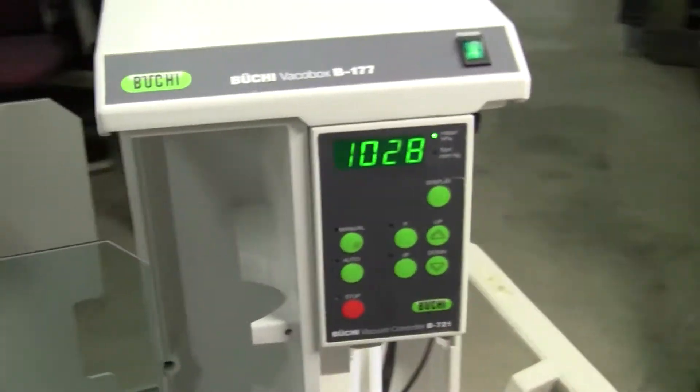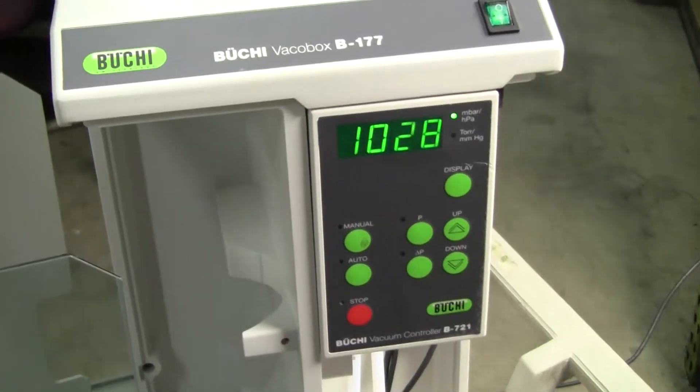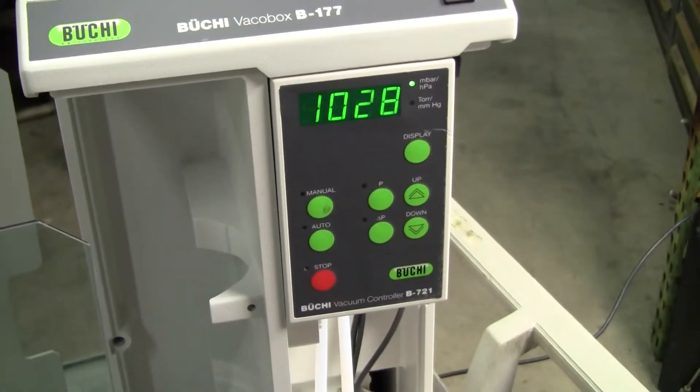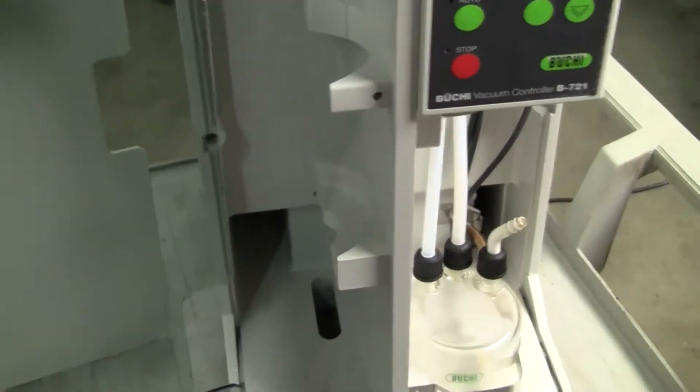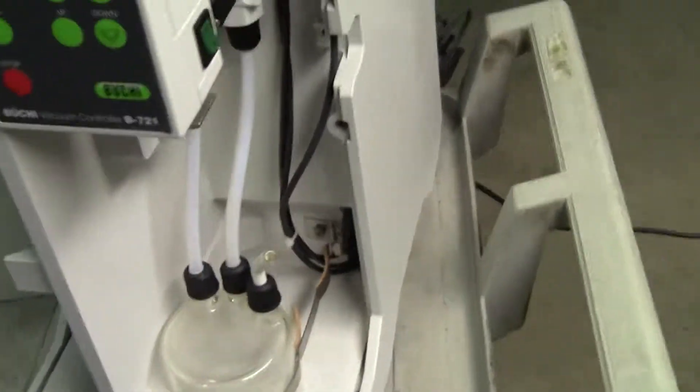Hi, this is Michael from HitechTrader. Today we're looking at a Buchi Vacobox B-177 with a B721 vacuum controller. We are missing the condensation glassware. However, I just wanted to demonstrate the pump functionality.